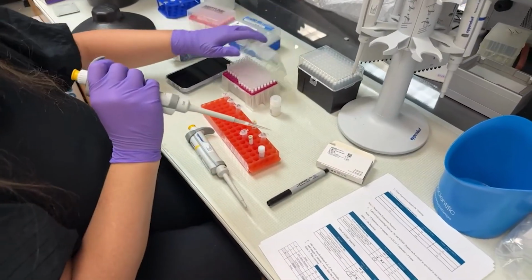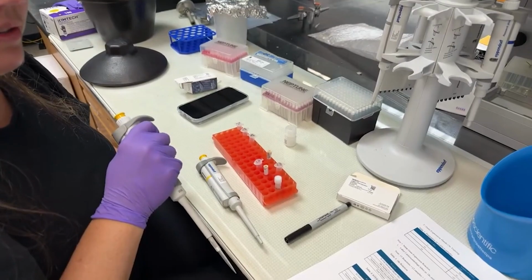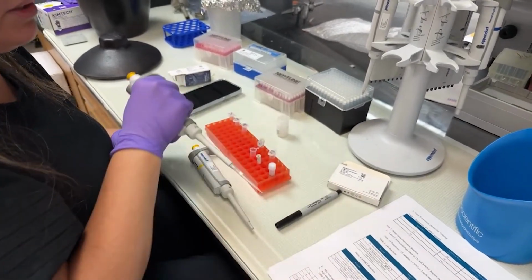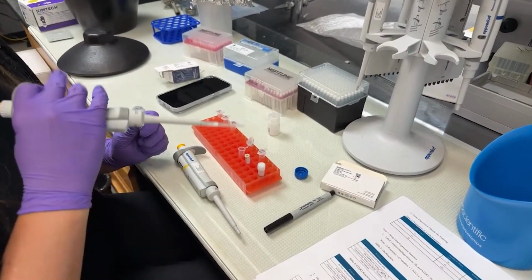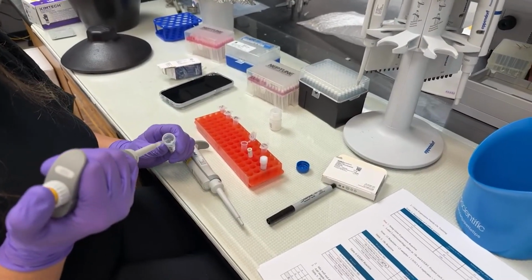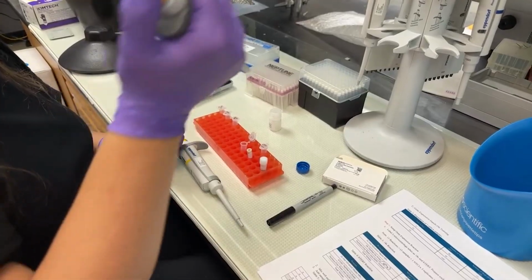Yes, there's different kinds of water. There's DI water, there's nuclease-free water, but by definition, a nuclease is going to degrade DNA or RNA. We want to keep that out of our reaction or nothing's going to be accurate. So make sure you have some high quality water that you're using for the experiment.